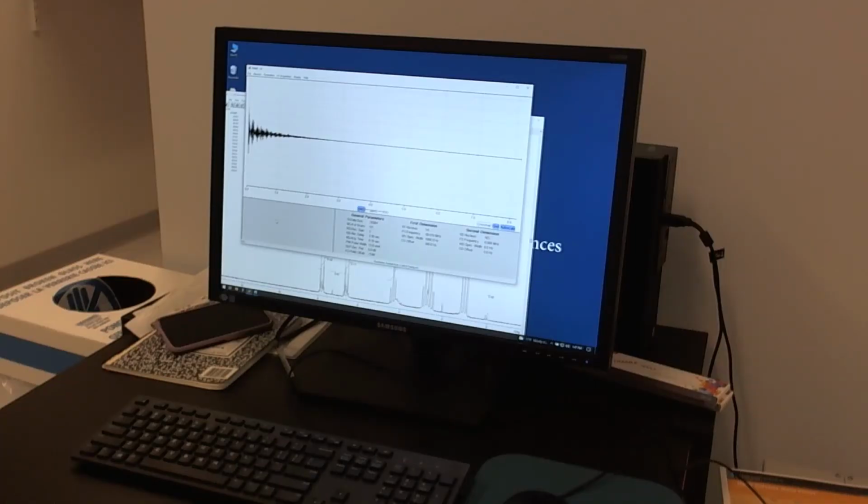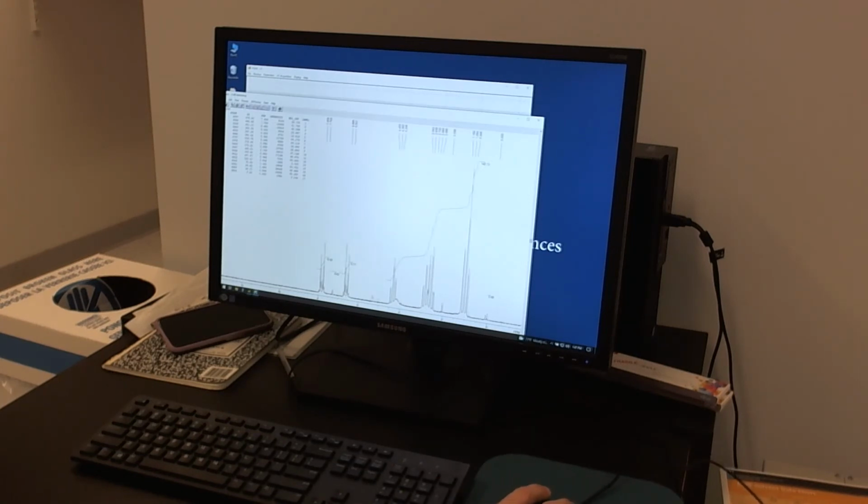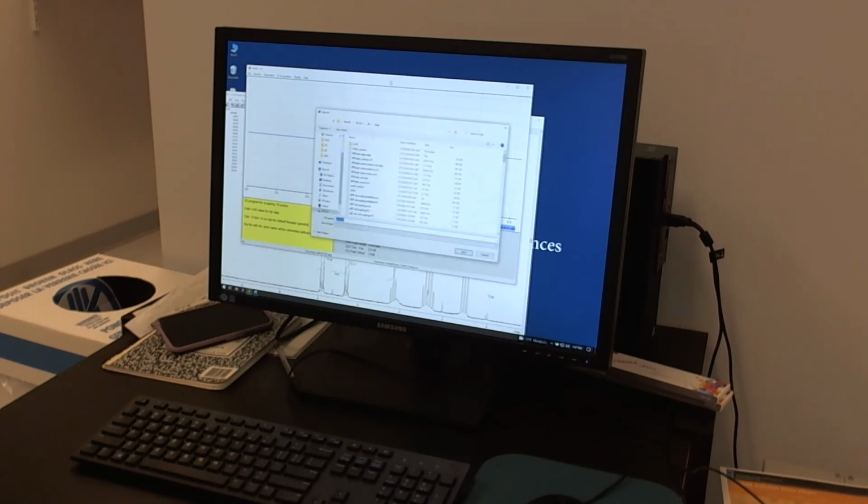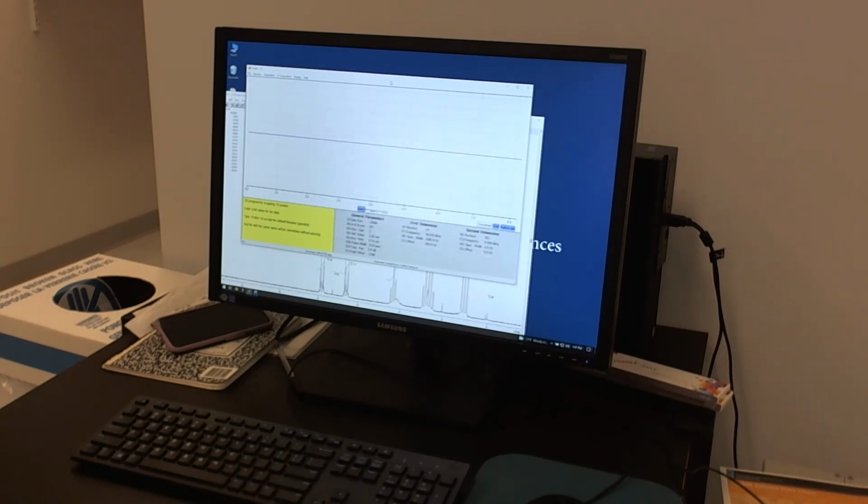Now there are two programs that are usually open. One of them often looks like a spectrum you're used to seeing. This is NUTS. And the other looks unfamiliar, like some squiggles. This is the program that collects the raw data. It's the NMR program. This is the one we want to start with. Just click on that window, type ZG, enter, and then hit enter just to save over that file name again. Or you could have clicked save.